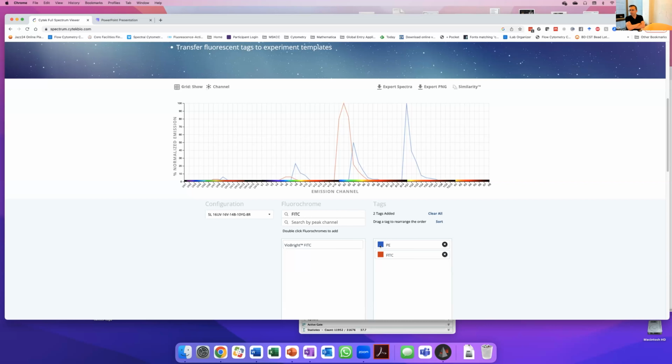And the other question is, can we use lower percent ethanol, lower than 70%, or a lower incubation time, to improve unwanted effects on PE? That's a very good question. Actually, Derek, do you have experience with this? There's quite a narrow range. It doesn't have to be exactly 70%. I would say maybe between 60 and 80%.